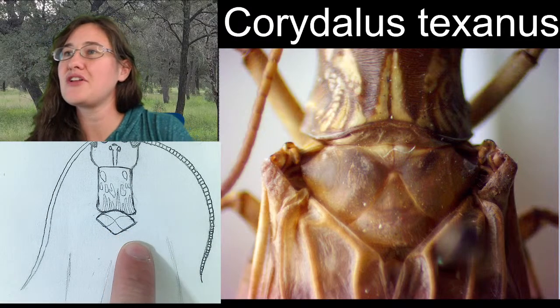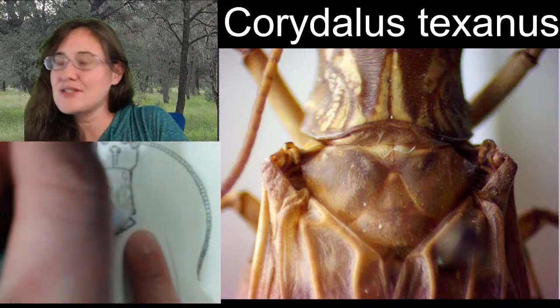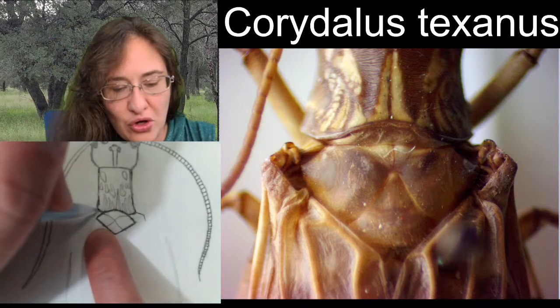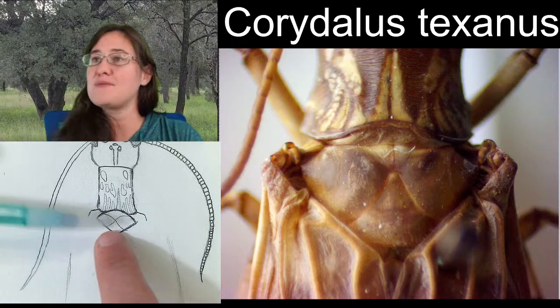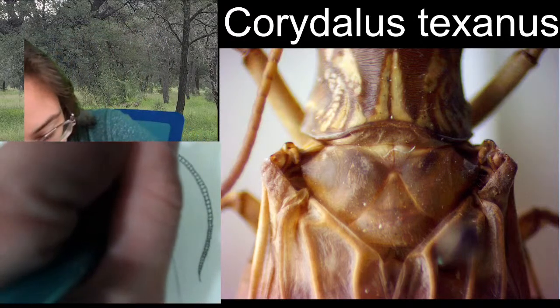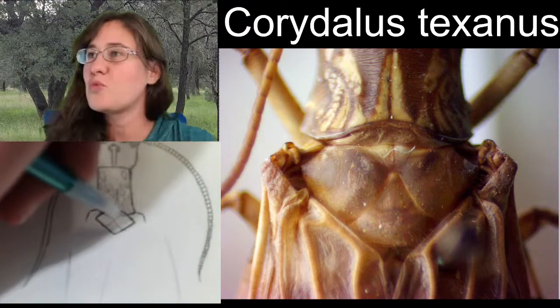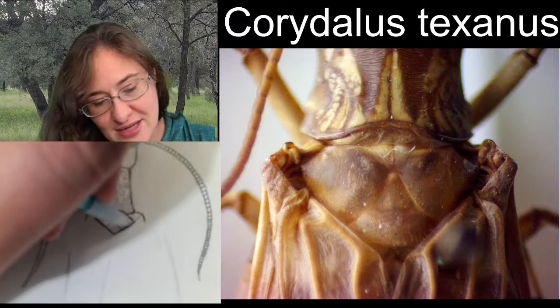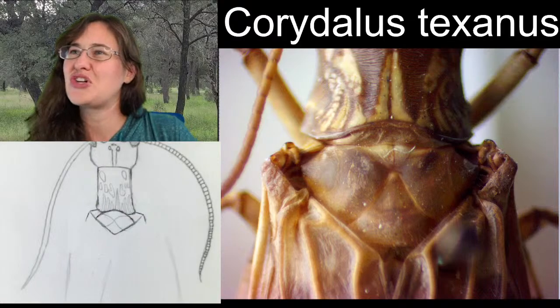It looks like a little rounded X. Now, these look like the wing connects and then folds down, and that's what's going to be giving our Dobsonfly these shoulder-like features. It's not because he's got shoulders, but it's just about how his wings fold, it looks like. And so his wings come out like this, and then they fold in. Cool.